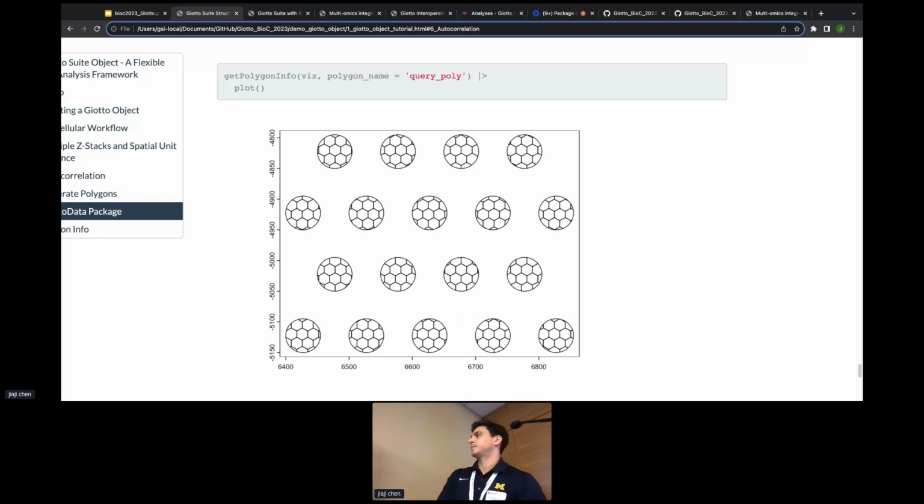Do you want to take this one? The question was about Giotto's dependencies and leveraging or dealing with those in situations of interoperability. Yeah, I think Giotto right now is around 30 different package dependencies for R. Right around 30 mandatory installations, I believe. I don't have the number offhand. I apologize. But in terms of converting, it's really just a matter of what analysis you want to do.